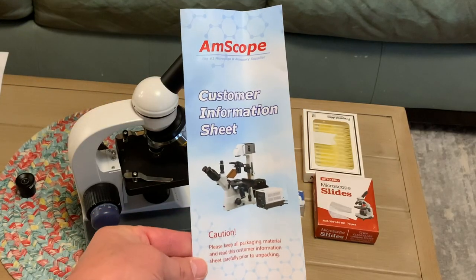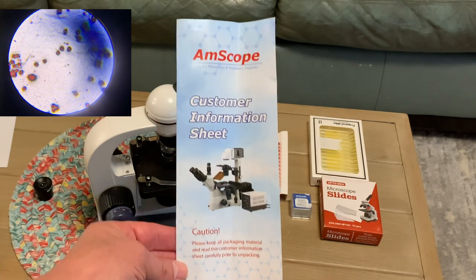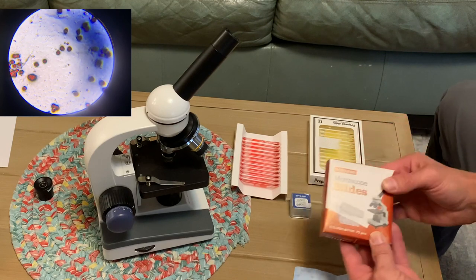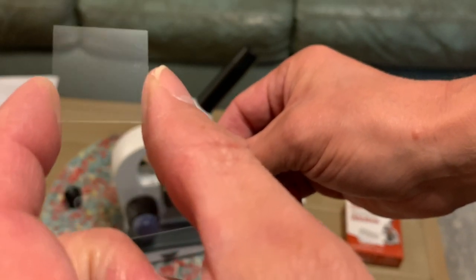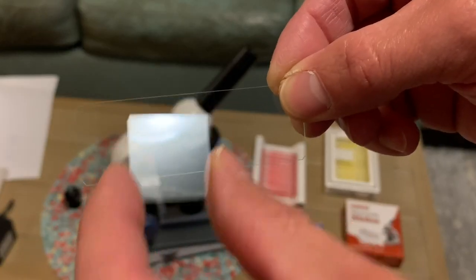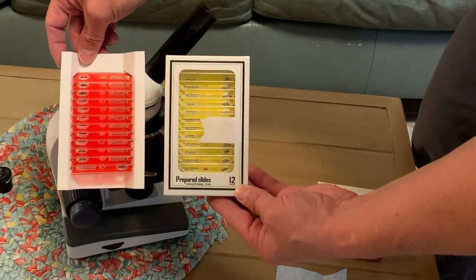With your Amscope you're going to get this customer information sheet. It has a download link with all the information you might be looking for, but we'll go through those. Right here are some separate microscope slides and these are the lens covers. These are sold separately — you can see the slide cover and the slide in case you want to look at your own things, and you can also get prepared slides separately.